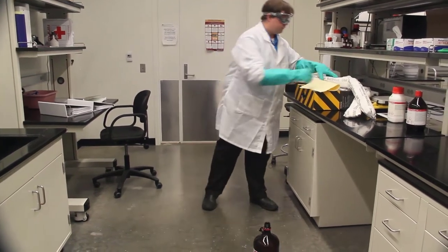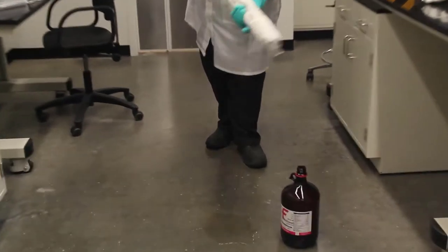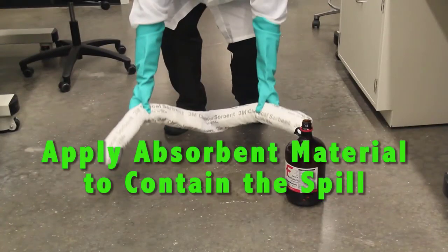Matt has also located the equipment for cleanup. In this case, he will use absorbent materials specifically designed to contain and pick up spills in the lab.